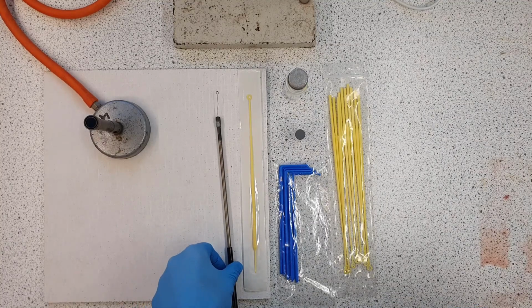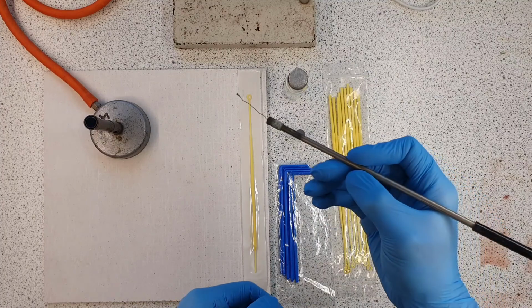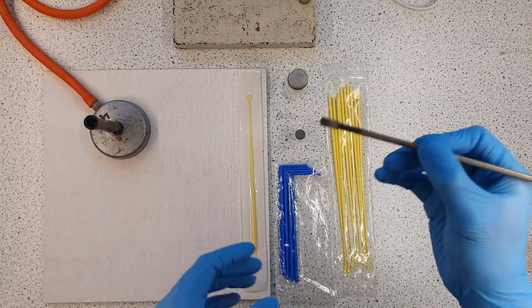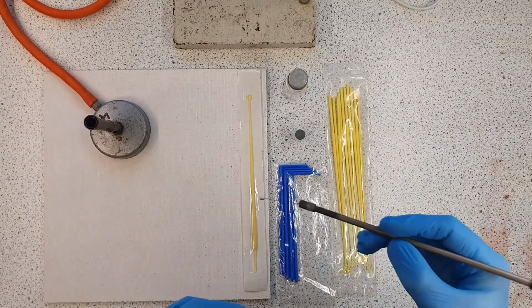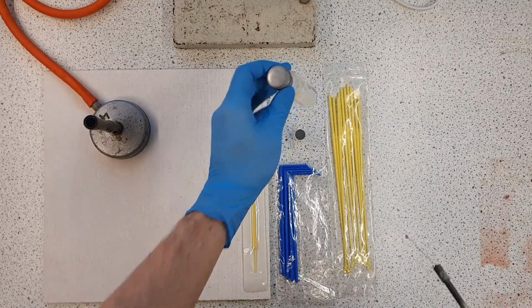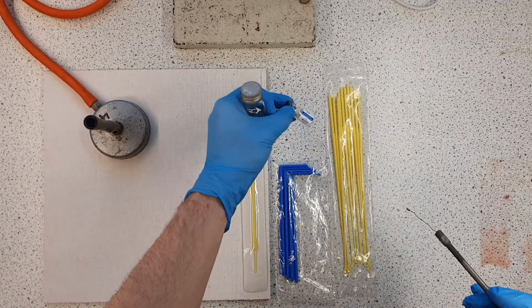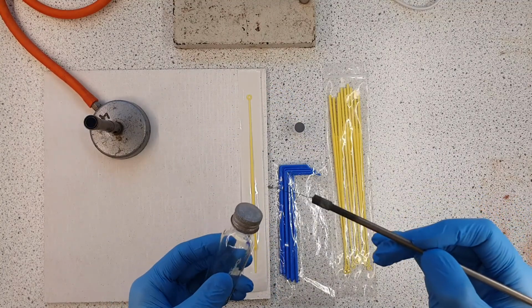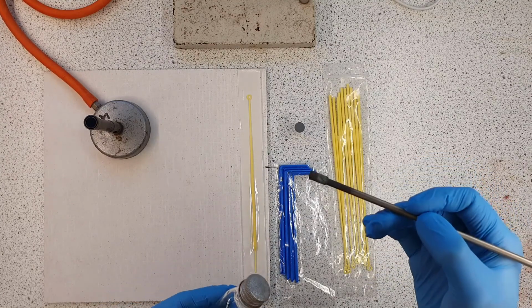So another part of aseptic technique is the proper handling of equipment. Especially when we're doing complex operations like transferring something from a bottle onto a plate and so on, we need to make sure that whenever we pick something up, so this is a sealed McCartney bottle, and you have smaller variants thereof, which we're going to be using later on, you make sure that whatever you're opening is open for as little time as possible and is done in as sterile a way as possible.